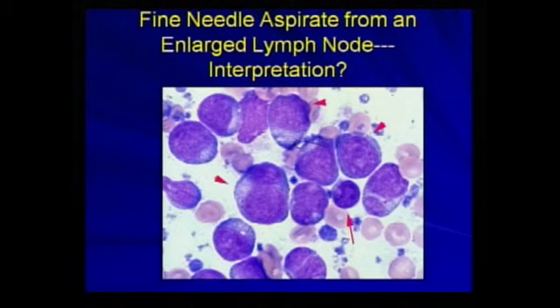Okay, now we are looking at an aspirate from an enlarged hard lymph node. What do we see here? Well, I do see erythrocytes, but the predominant cell here, I see one small mature lymphocyte right here. The majority of these cells are large. They're significantly larger than the neutrophil. So these are blast lymphocytes. It appears that we have one or two cells here either with an irregularly shaped bilobed nucleus or that are multinucleated. This one actually looks cleaved.